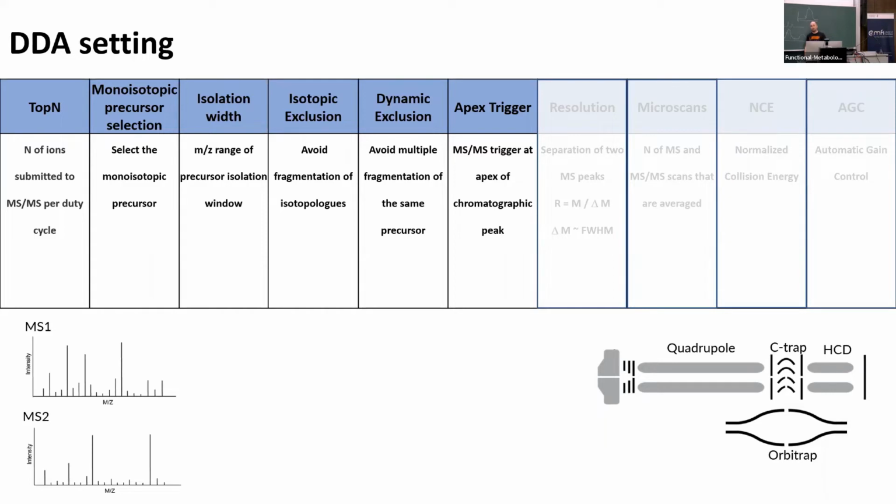Now, if you have very stringent dynamic exclusion settings, it's going to be put on the exclusion list and not triggered at all. So it would be good if the machine would actually wait till that peak is on the top and then trigger the MS. So this is a very nice setting on the Q-Exactive platform, and I think on the newer Thermo instruments, the so-called apex trigger.